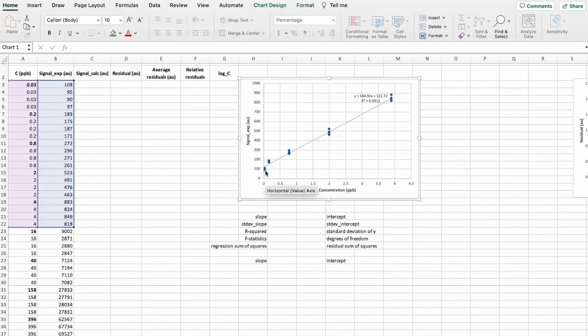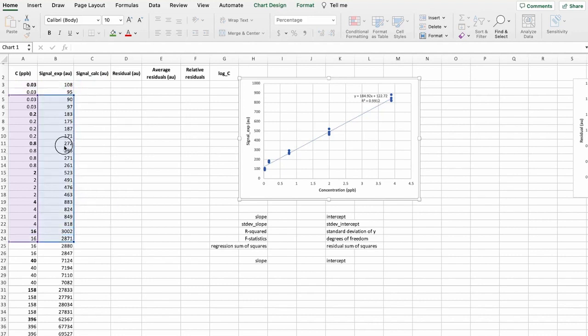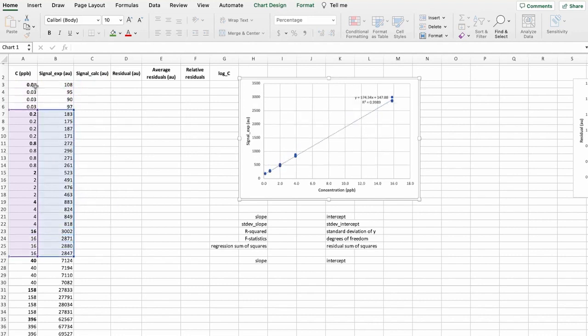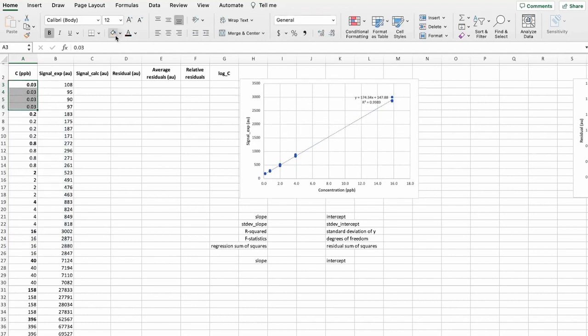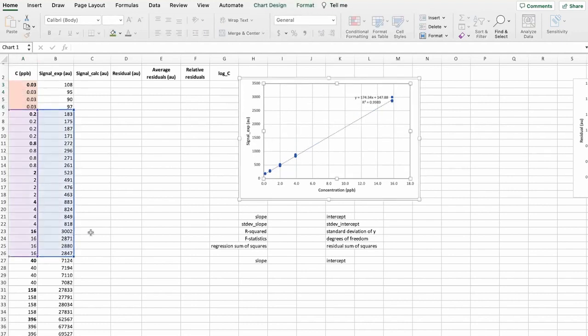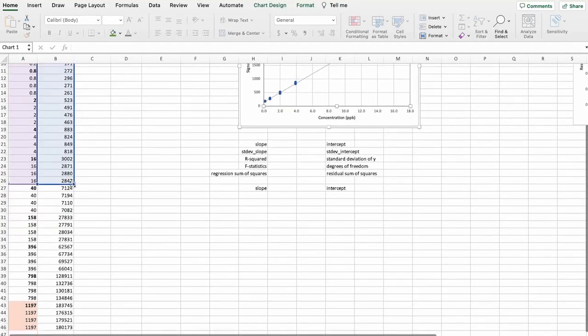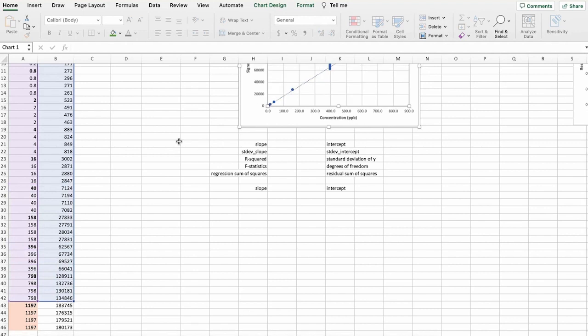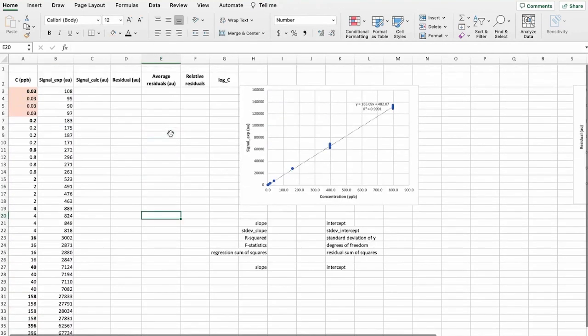And again, we see here that the lowest concentration is also deviating from this linear line. So this is not linear and we should leave that out from our data as well. So let's mark and let's re-graph for the whole range that we think it's linear.